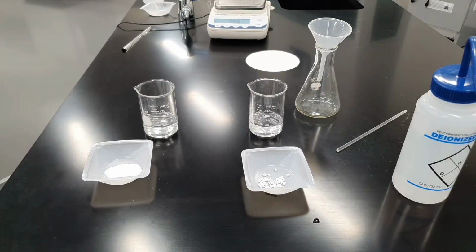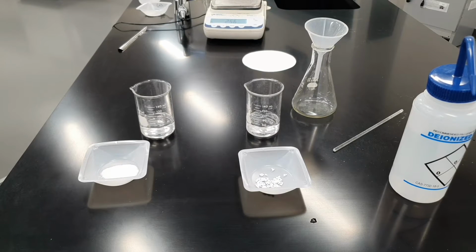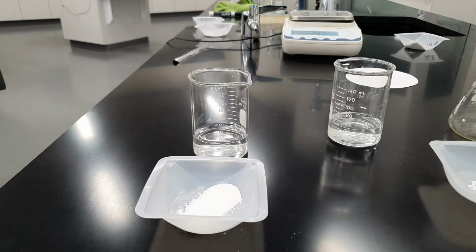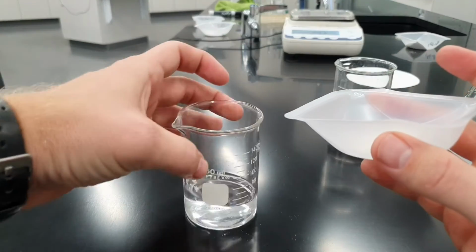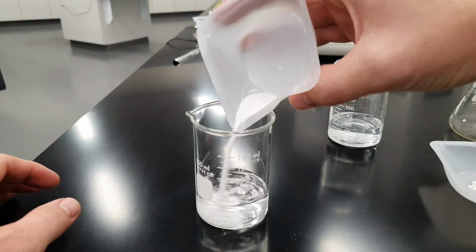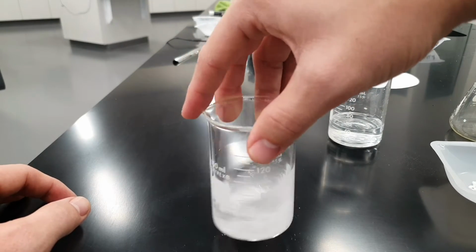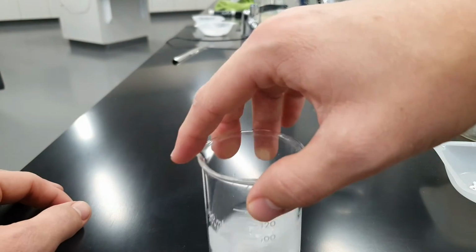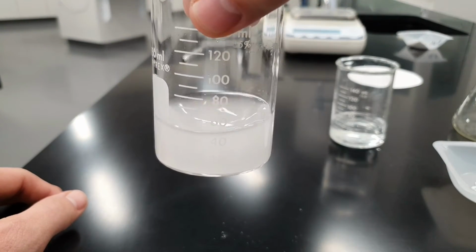Now what we're going to do is pour them in the beakers and see what happens, see if these dissolve, or if these are soluble or insoluble compounds. We're going to pour this in here and see if it dissolves. So we've got our 2 grams of sodium carbonate here and our 50 milliliters of water, and let's see what happens as I pour that in, if anything happens, or if I'm just kind of wasting time here. But I imagine it should dissolve. So we're going to stir that a little bit and let that sit. I'm going to keep stirring, and we'll come back and take another look to see if it does dissolve all the way or not.